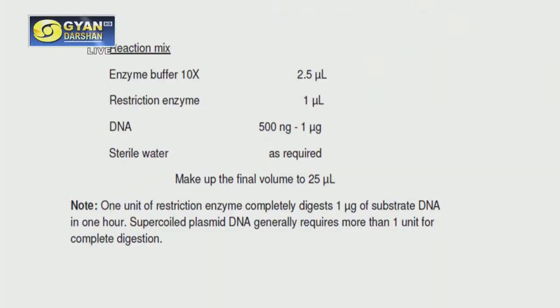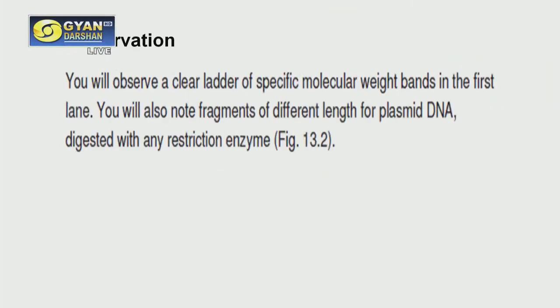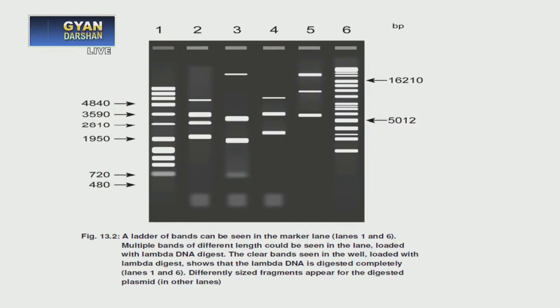Now the next part is, after you have set up the reaction and incubated it for 3 hours, the next task is to check whether the DNA has actually been digested or not. For that, you have to again go for the experiment we discussed in the last session, that is agarose gel electrophoresis. For those who have not followed that session, I will just recap it in brief once more. Before I go into that, you can take a look at the observation. This is how it will look.